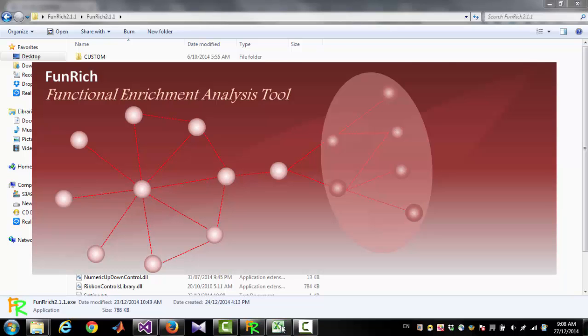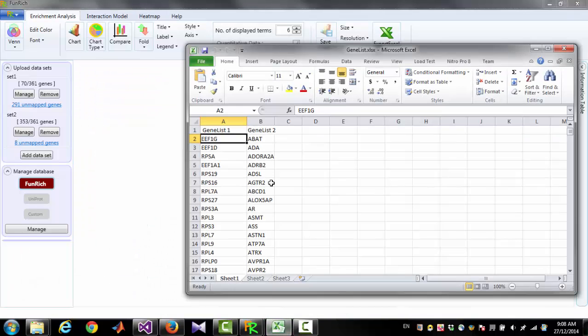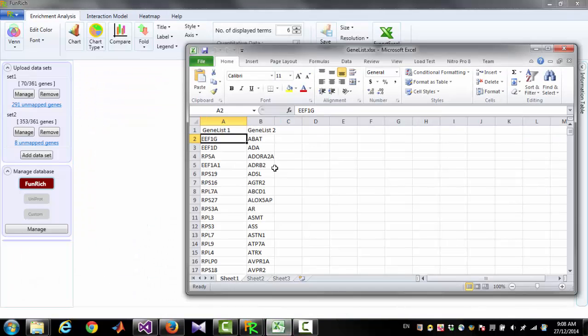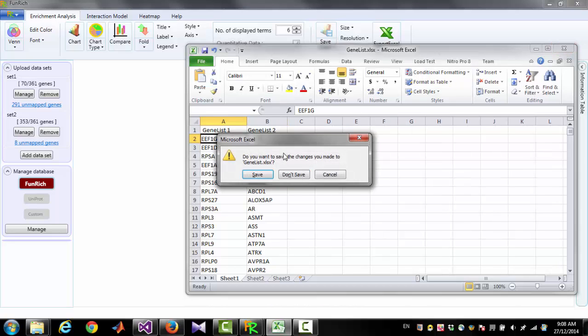Now we have an Excel file which contains two sets of genes: GenList1 and GenList2. We are going to open this file in Furnridge.